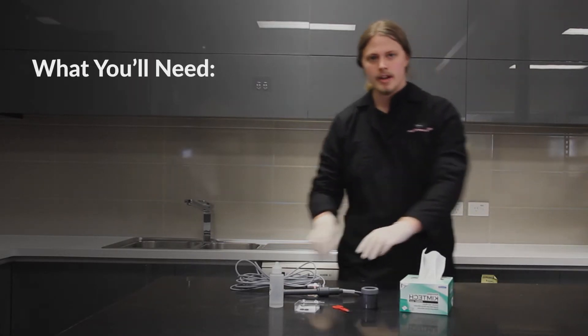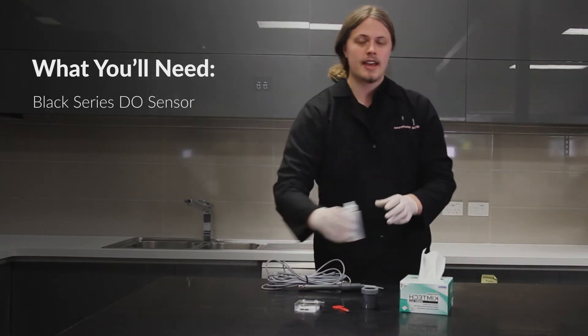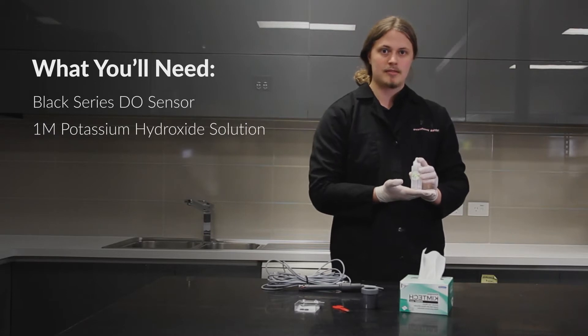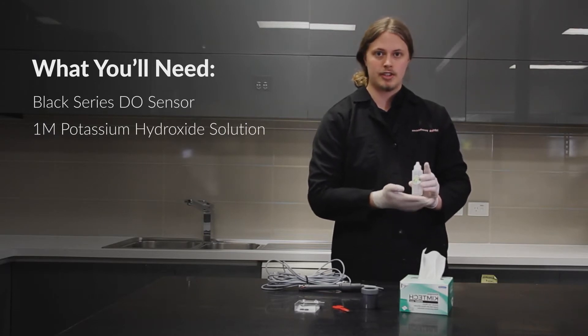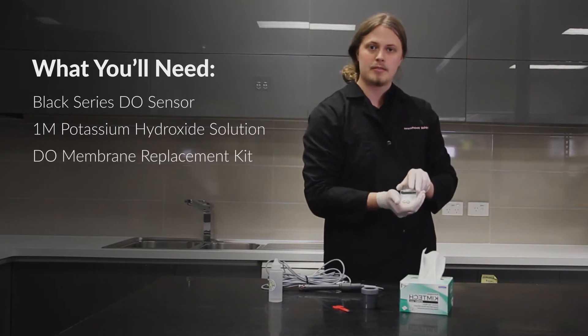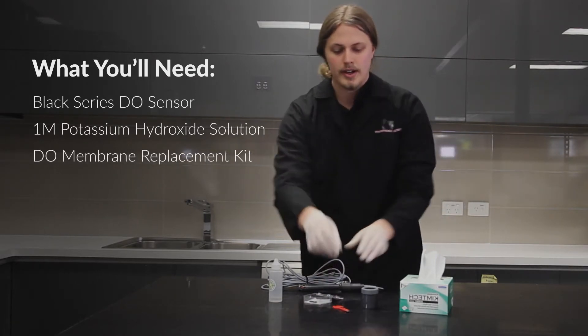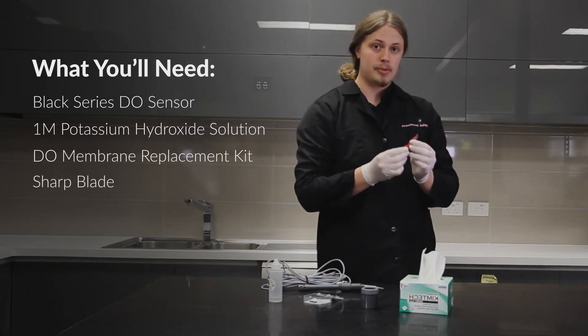Alright, to do this process you'll need: one N4M sensor, a bottle of 1M potassium hydroxide solution, a membrane replacement kit with at least one membrane and one O-ring, and a sharp knife or box cutter.